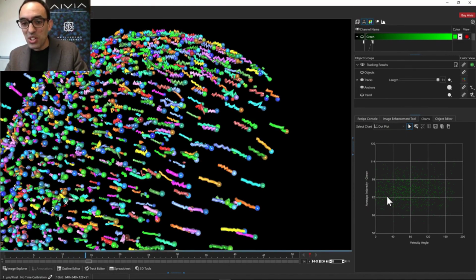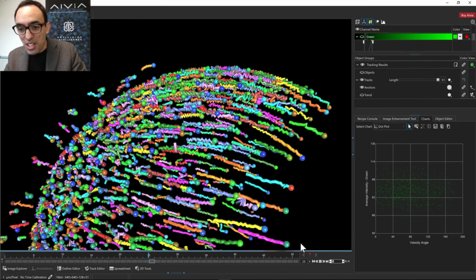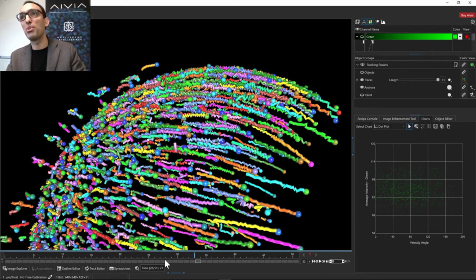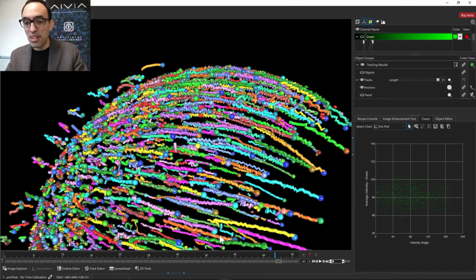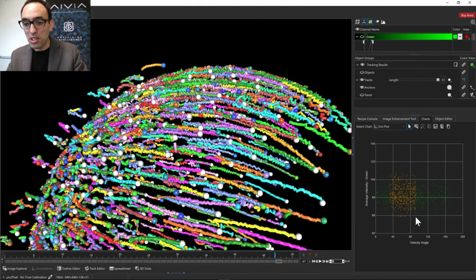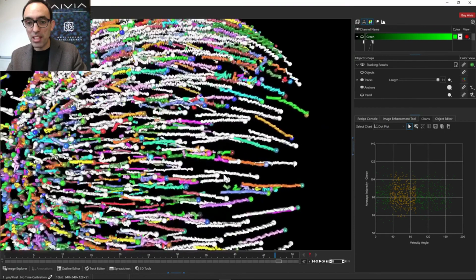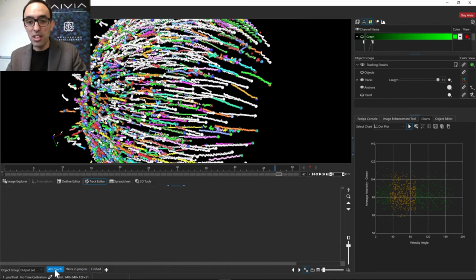Yeah. So this may be too small for you as well, but what I wanted to show is that this is updating, it's connected up. So as the data is progressing here, it's updating in real time the plot on the right-hand side. And you can select things from the plot as well. So I just selected a few tracks, and it shows them selected in this view. They become white, and they are also selected in the track editor, as well as in the spreadsheet.